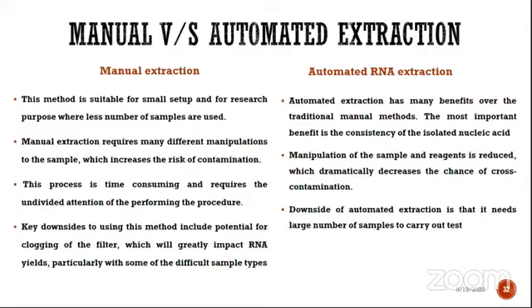So during manual extraction, clogging of the filter can take place, and this clogging greatly impacts the RNA yield. It occurs due to the different sample types.